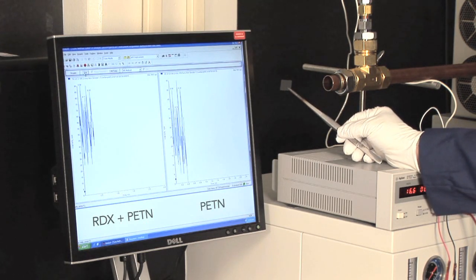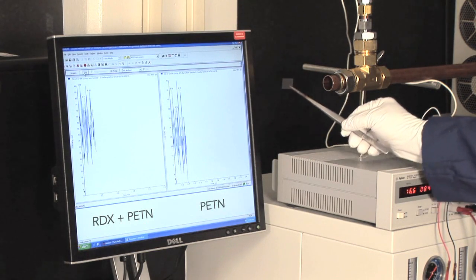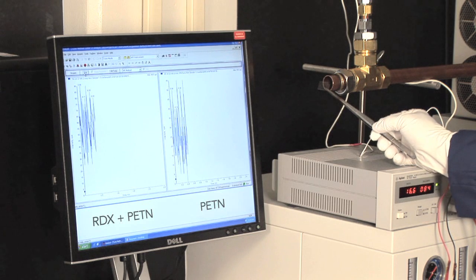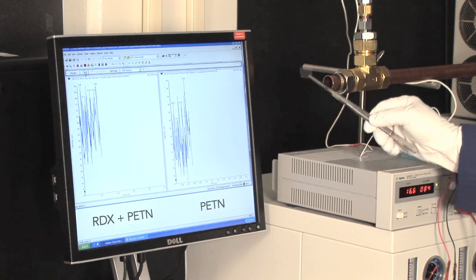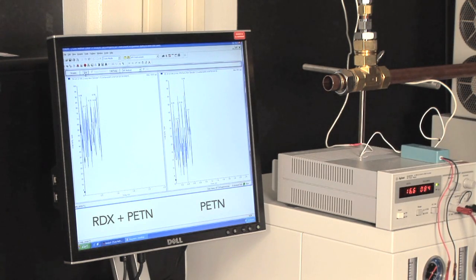This is a glass microscope slide with no sample on it. Here we sample the vapor coming off the slide, and as a blank, you see no response for either the RDX and PETN on the left-hand side or PETN on the right-hand side of the screen.